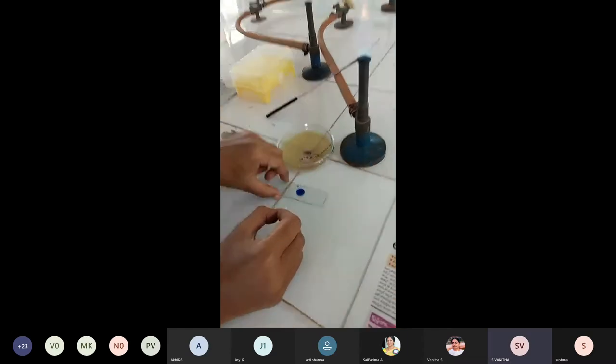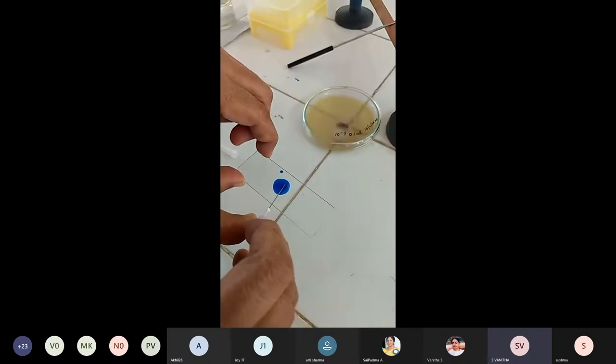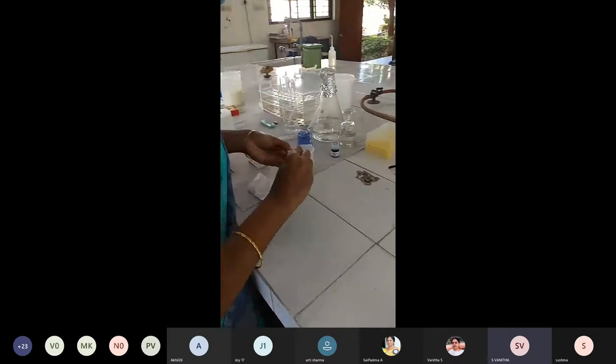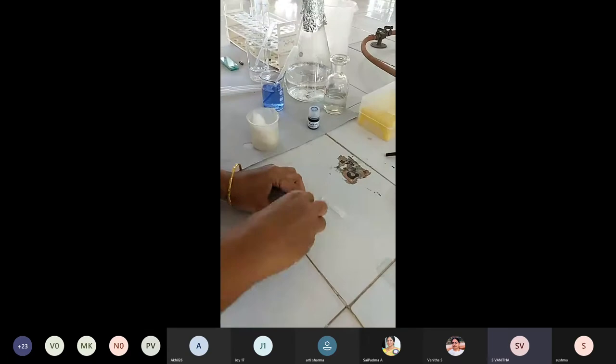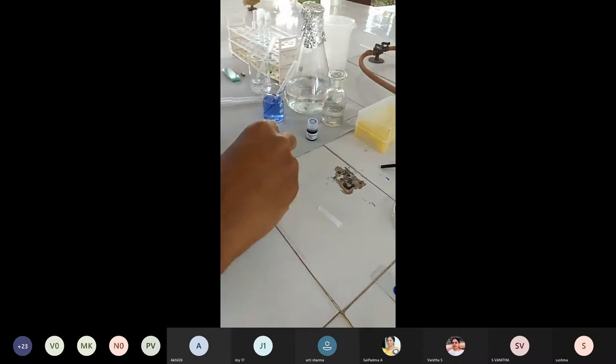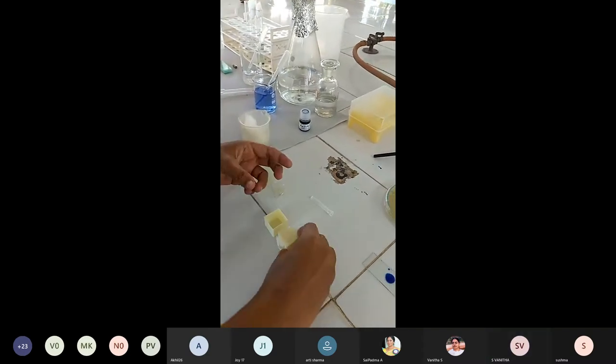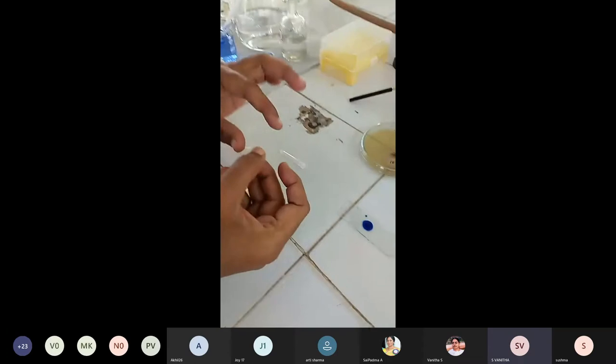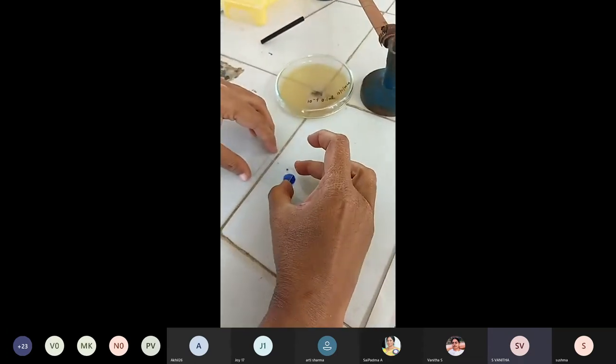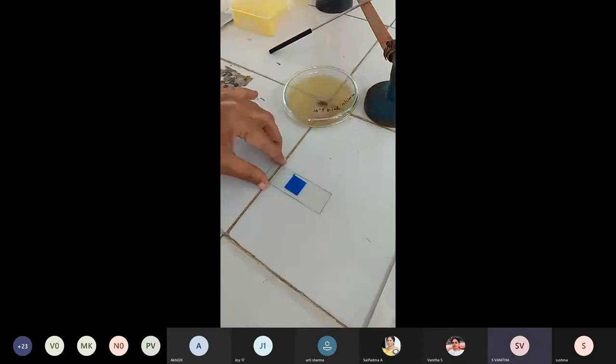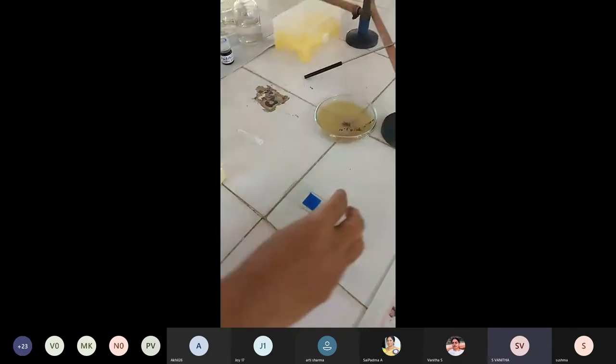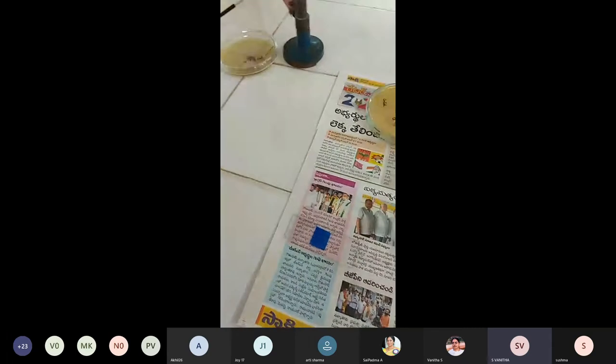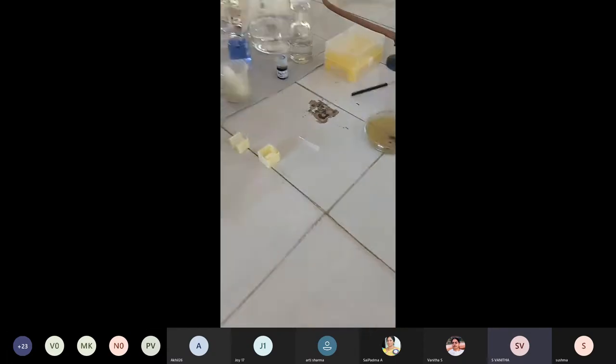So just with the needle, you can see that I'm just very carefully and just spreading it, not disturbing it much. I'm just taking one small glass coverslip. As we have said, we have to just place it at one end and release it slowly into the slip. So you can see we have prepared the slide. So this is the first slide what we have prepared, so we will keep it aside for the observation later. By the time we prepare the other two samples also. Today we will see other two organic samples.